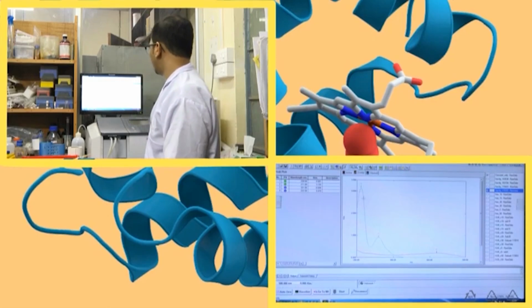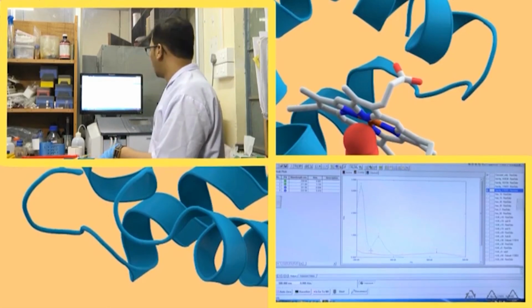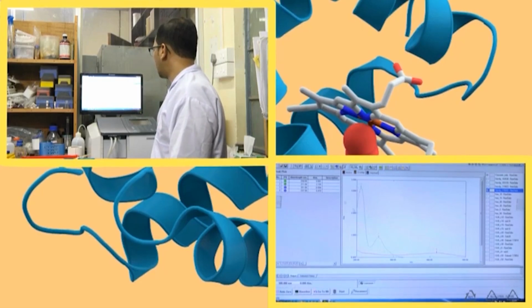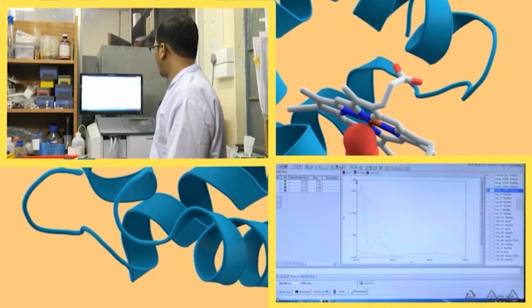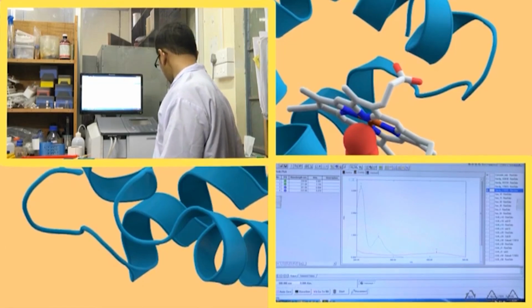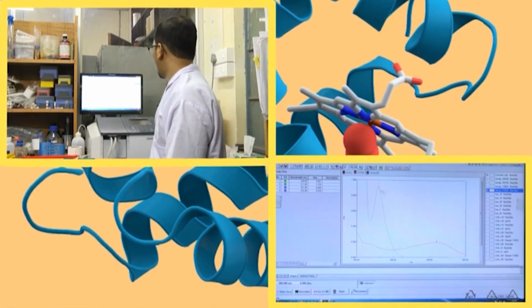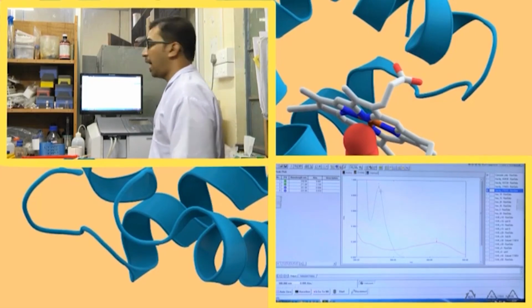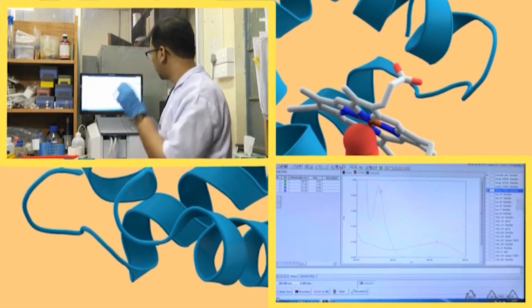This peak is below the 250 region, around 210, 211. Here 211 is shown, but the peak we are interested in is this peak, which comes around 259 or 260. Actually, gallic acid absorbs around 260 nanometer.